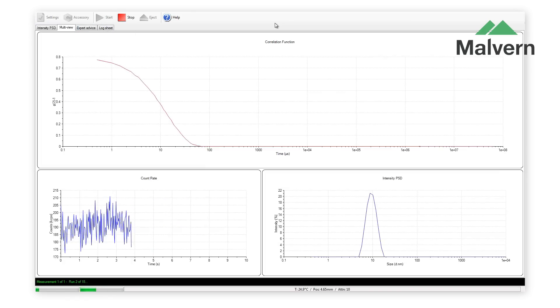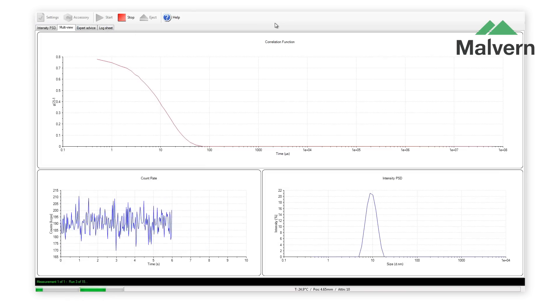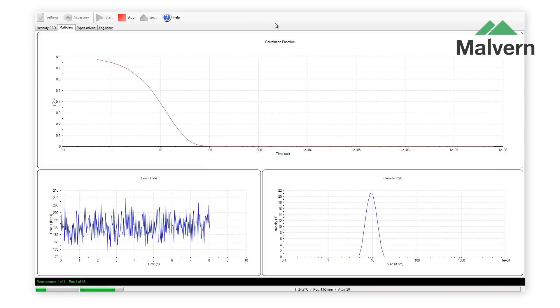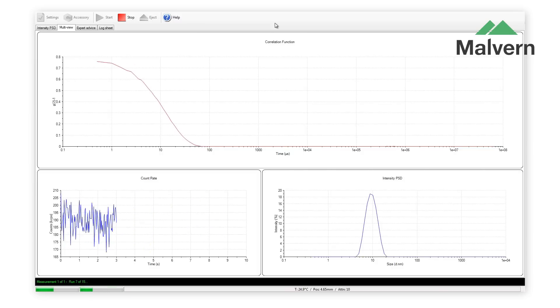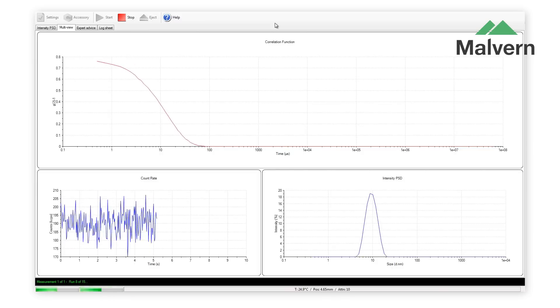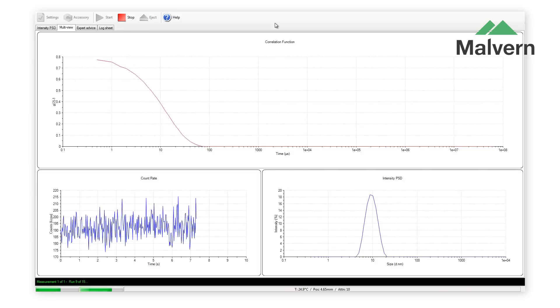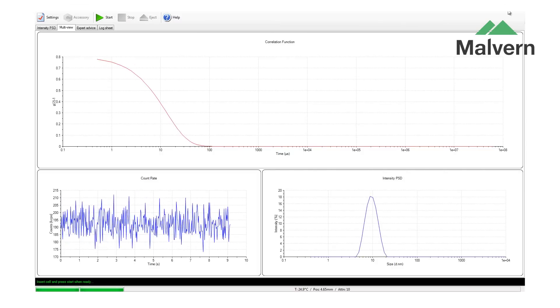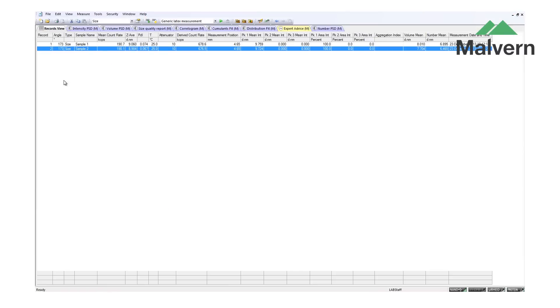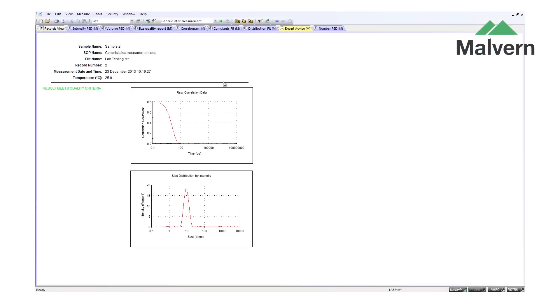During the measurement, you can see the correlation function continually being redrawn as more measurements are made, as well as the developing size distribution. At the end of the measurement, the results are displayed in the records view of the ZetaSizer software.